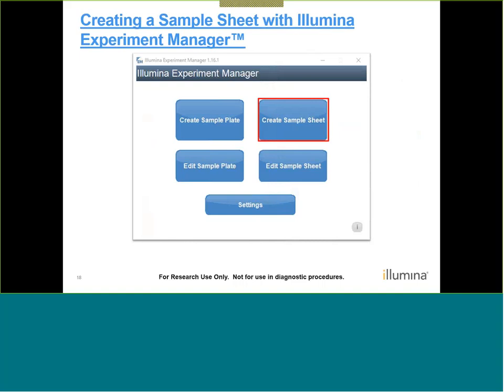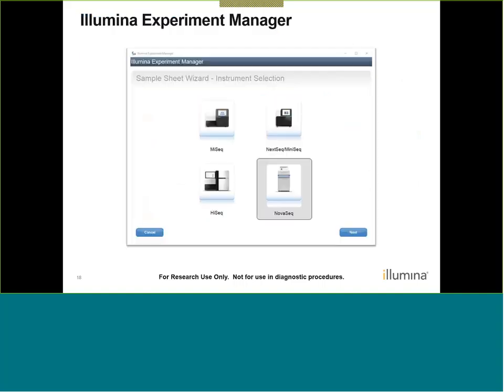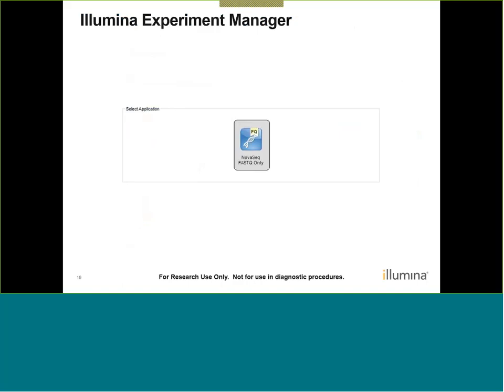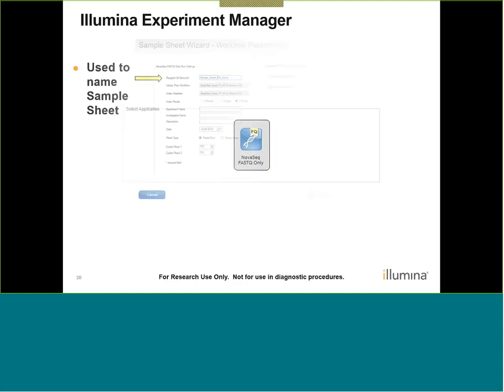When we launch Illumina Experiment Manager, there is an option highlighted in a red box to create the sample sheet. Clicking that box allows you to pick the specific instrument — in this case, selecting a NovaSeq. We can then select an application, and for the NovaSeq, the only option present is for FASTQ generation only, so we'll advance to the next window.